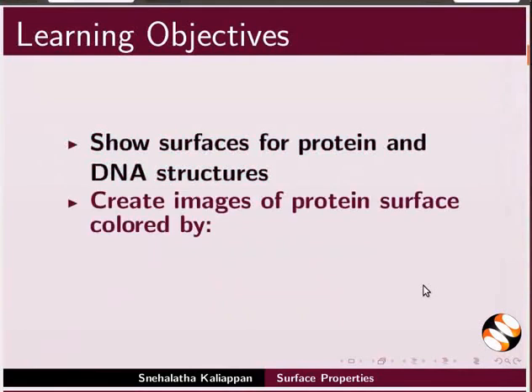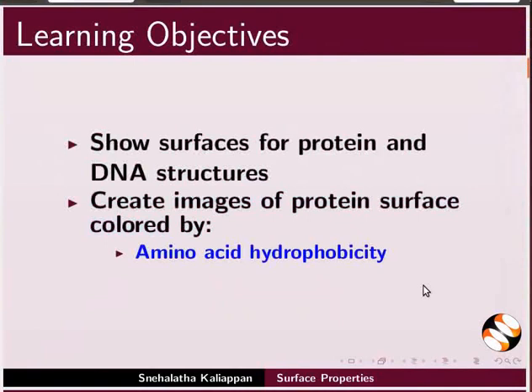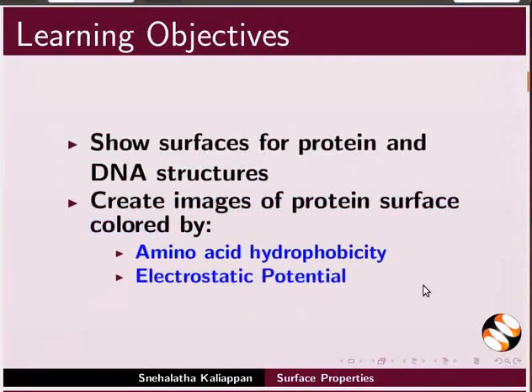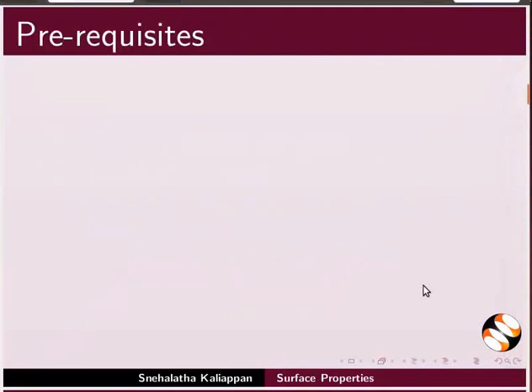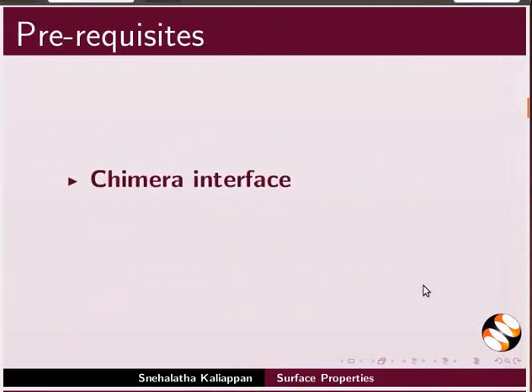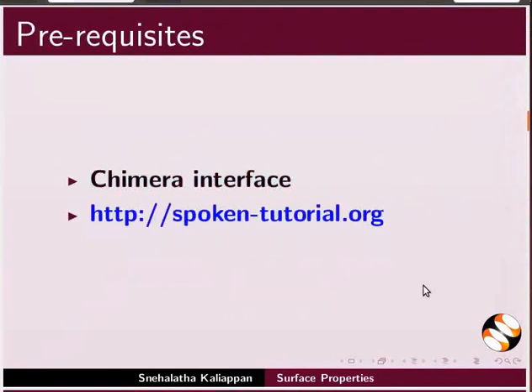We'll create images of protein surface colored by amino acid hydrophobicity and electrostatic potential. To follow this tutorial, you should be familiar with Chimera interface. If not, for tutorials, please visit our website.